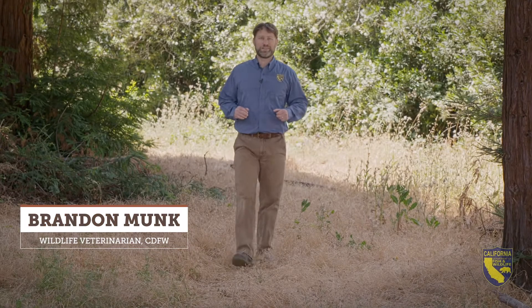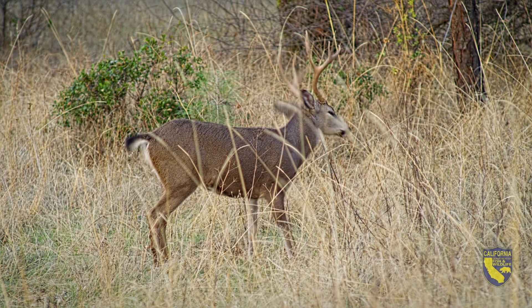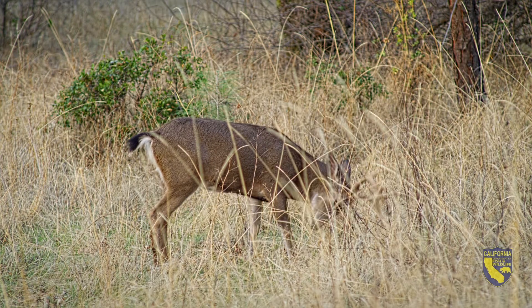Hi, I'm Brandon Monk, and I'm a wildlife veterinarian for the California Department of Fish and Wildlife. I'm also a hunter, and I understand how chronic wasting disease could threaten our deer and elk populations and our hunting opportunities. Today, I'm going to show you how to extract lymph nodes from a deer or elk for chronic wasting disease testing.